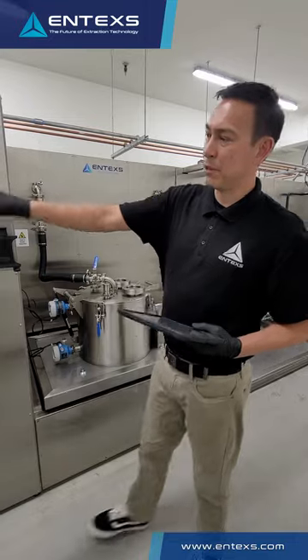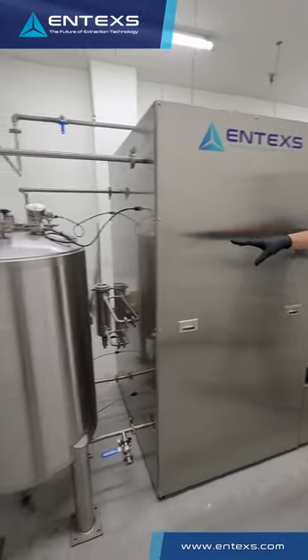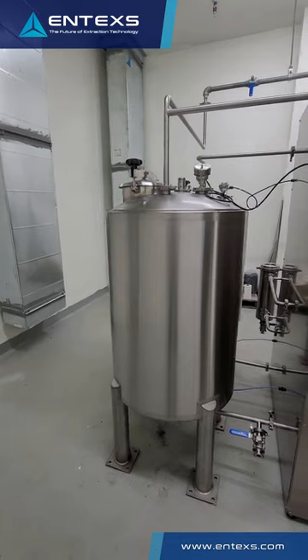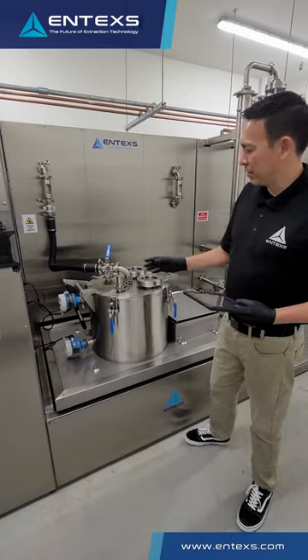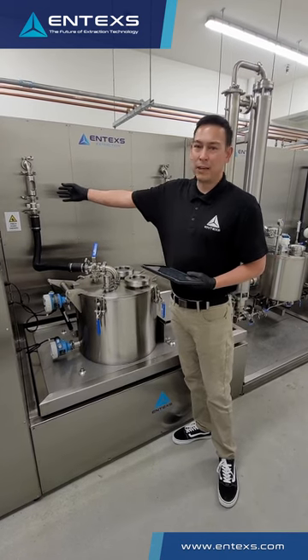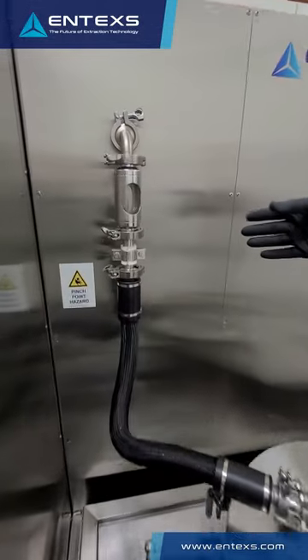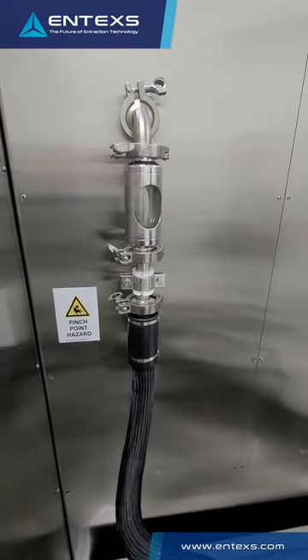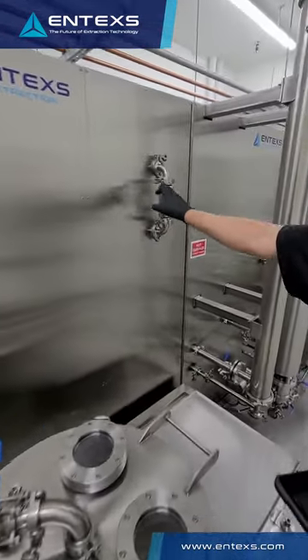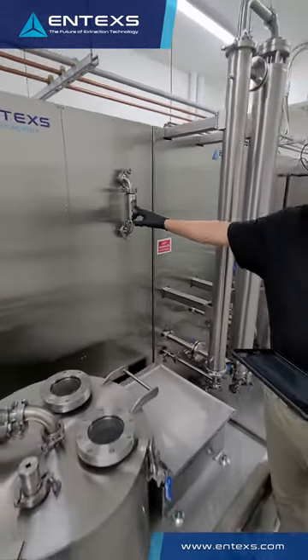Everything over here is built by our team — from the tanks that are insulated and jacketed, to the process piping, the sensors, all of the equipment that goes onto this. So while the process is running, we're monitoring both the temperature of the extraction loop as well as having visual feedback from our sight glasses. This allows you to look at the color content and quality of that extraction.